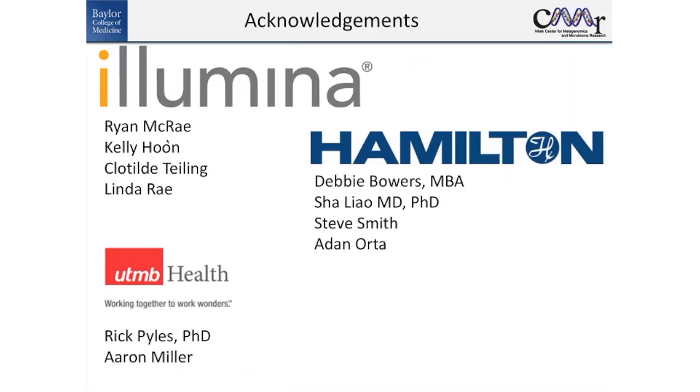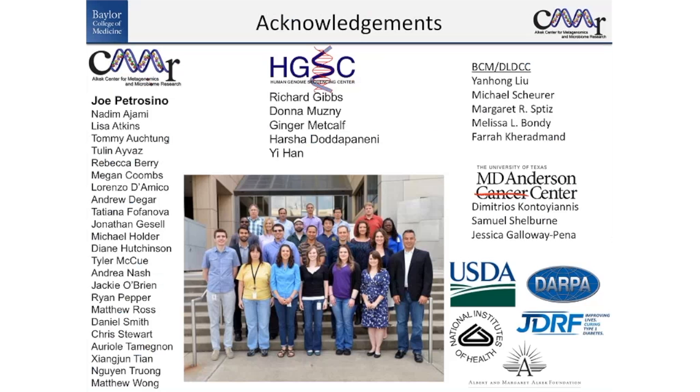Thank you, Russ. So we have quite a few questions on the line, and I will start asking them. One is from Sharon Beckman, and she's asking you, how does the selection of variable regions to be sequenced affect the species identification? And to continue with another question, why V4, why not V3 or V3, V4 together?